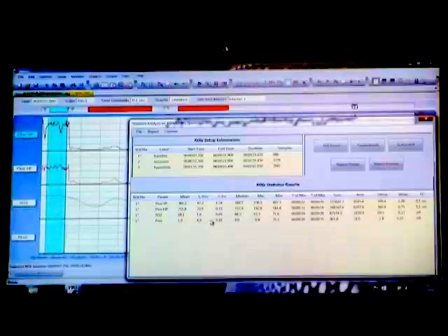Within those parameters, we have the mean or average readings for the selected time period, the standard deviation, the standard error, the median, the minimum, maximum, time of minimum, time of maximum, total sum of readings throughout the selected region of interest, the area under the curve for the selected region of interest, the offset, slope, and any time constants which have been applied.